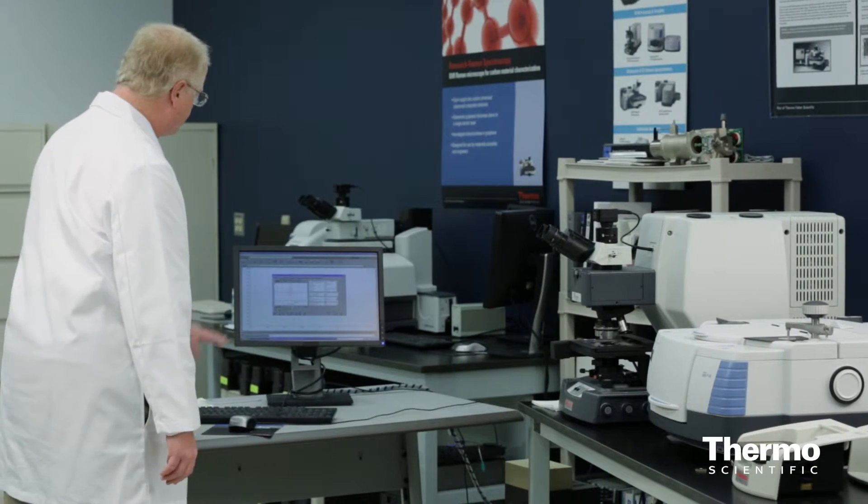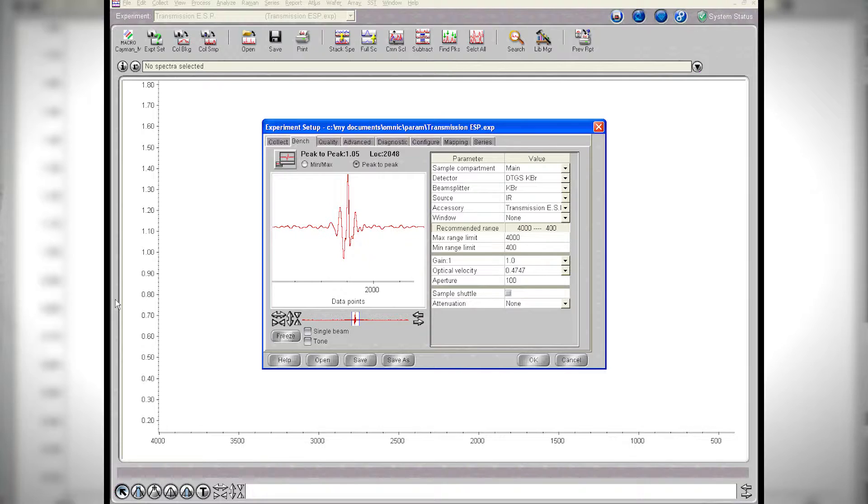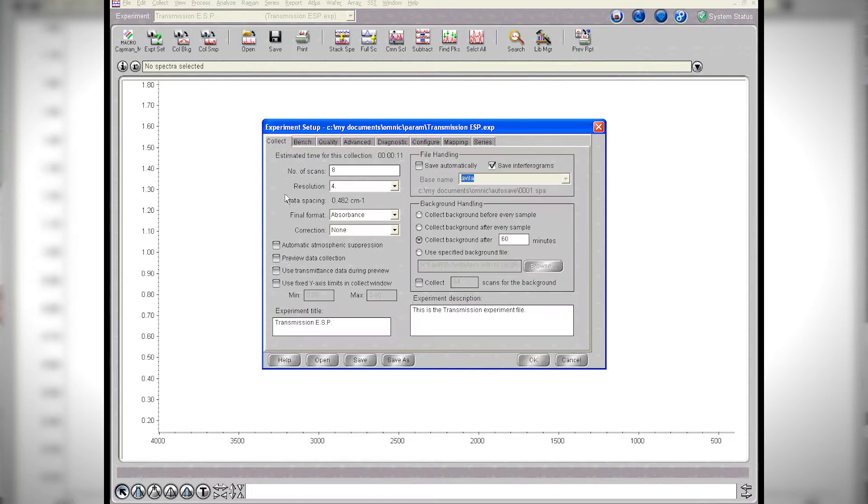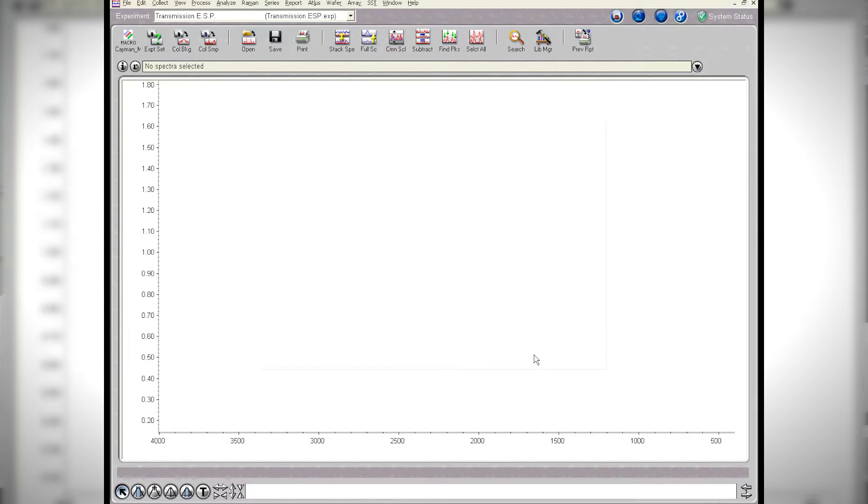Now you can see the software is set up here for a moderate resolution, a four wavenumber resolution experiment using the DTGS detector, the deuterated triglycine sulfate thermal detector. And running at a moderate speed, I'm going to collect eight scans at four wavenumber. That's all I need to know, so let's go ahead and run.